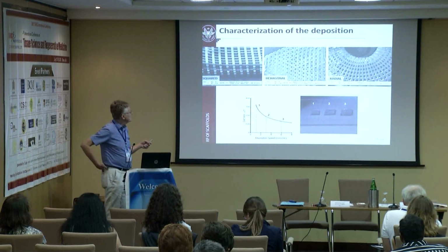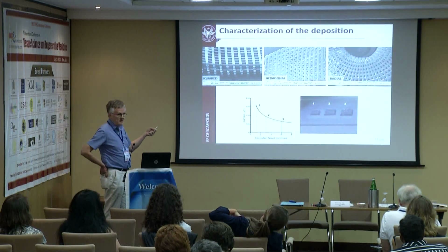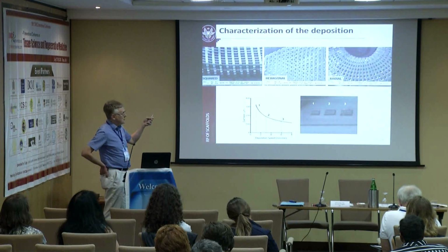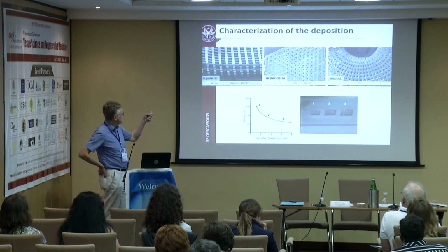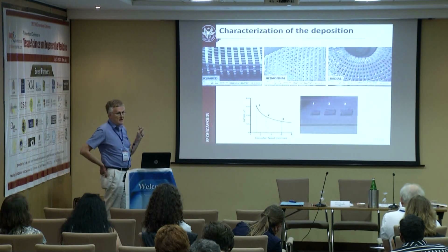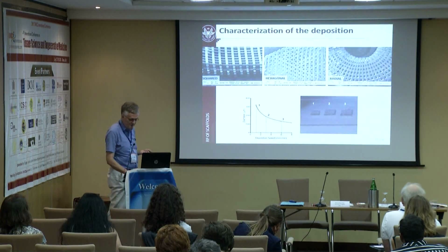So here I report the SEM of three scaffolds deposited with the coaxial needle system, according to three different patterns of deposition, geometrical layouts: square, hexagonal, and radial. And here there are three scaffolds characterized by the same interfiber distance, but increasing fiber dimension.